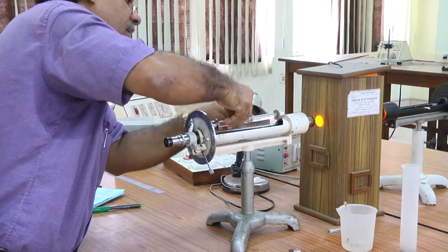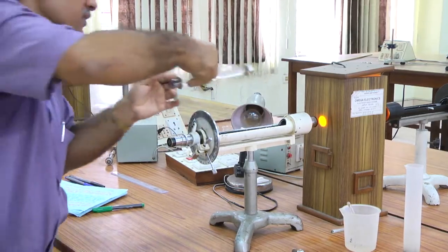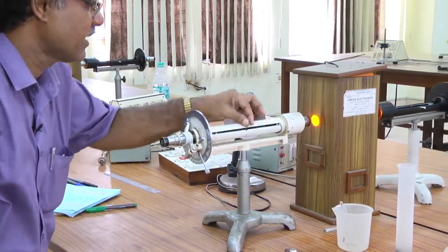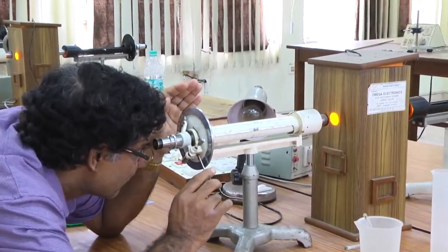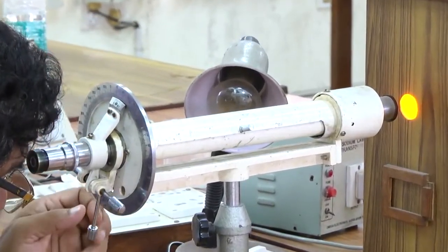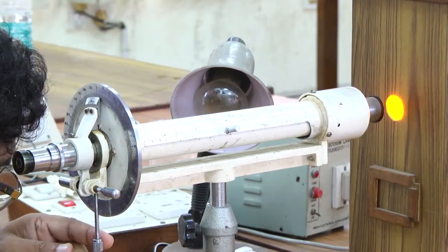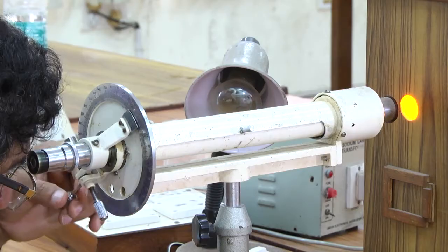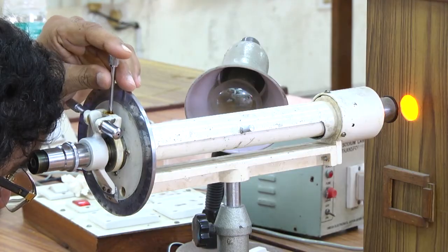Oh, okay. So, I think this is the flat edge we have to put down. Then it will be in the center, the column will be at the center. Yes, I can see. So, from here there will not be any rotation of that one. All the time, here only one electric... no rotation, but I think in this same way you will get these 4 uniform positions, but at some angle.